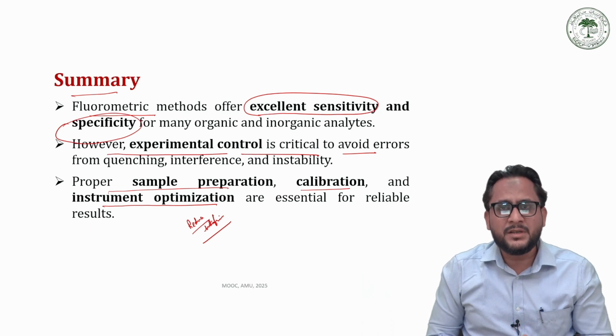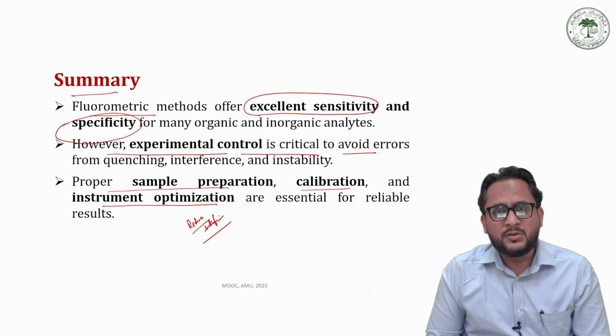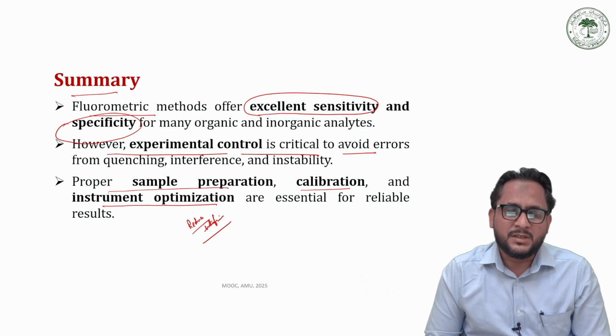So with this, we have completed molecular luminescence spectroscopy, and I hope you have learned about the concept of fluorescence, phosphorescence, chemiluminescence, as well as the factors affecting molecular luminescence, and the main components of molecular luminescence spectroscopy, like the light source, monochromators, detectors, output device, and how we measure the concentration of these samples, as well as their qualitative studies by direct fluorescence measurement, by derivatization, or through quenching.